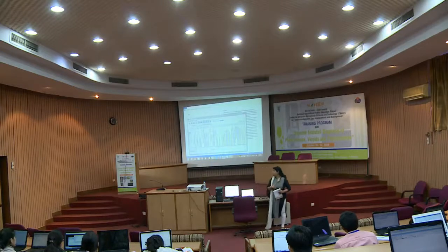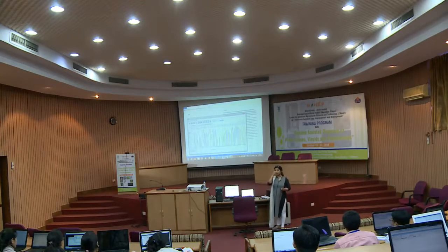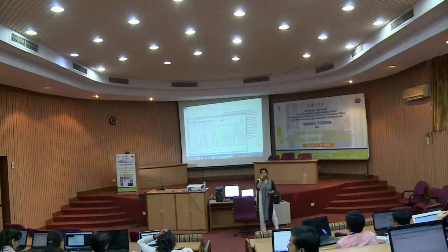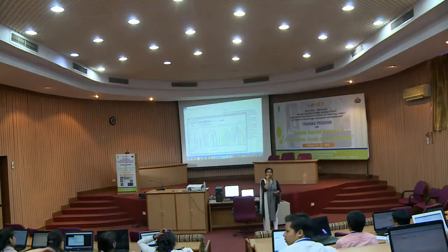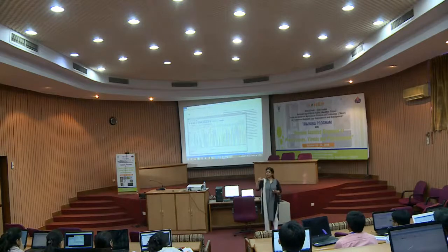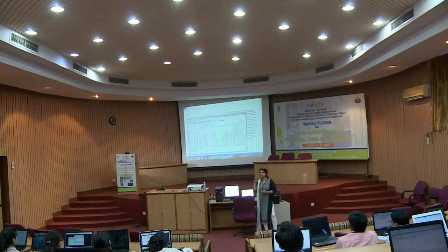Okay, one more thing, let's suppose at some point the data is not good. We have forward and reverse sequence. In one sequence the software is reading a base as C, but in the other, reverse one, it is reading as A, suppose. I want to confirm whether it is C or A. Contig will also give some base, whether C or A.